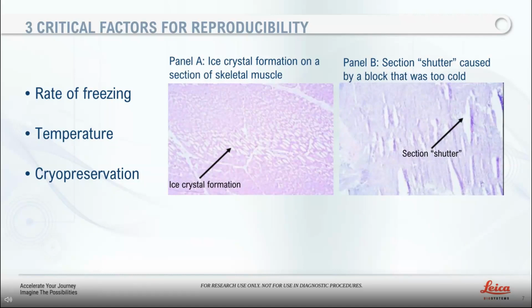Understanding the type of ice formation at different temperatures will help you understand why it's important to section your specimen below -131 degrees Celsius. Sectioning should be performed as soon as possible after biopsy or dissection and should begin as soon as the tissue is warm enough to cut. So remember, we would like to cut the tissue when it is in the vitreous or amorphous state, not cubic. Tissue should never be left overnight or for long periods in the cryostat, even if there is no defrost cycle, as the conversion from vitreous to cubic ice will begin. Crystals will expand the ice and damage cells.